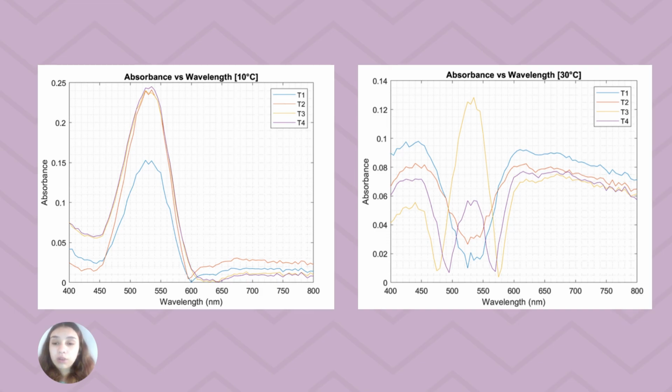Here we can see the graph of absorbance versus wavelength for the temperatures of 10 degrees Celsius and 30 degrees Celsius.